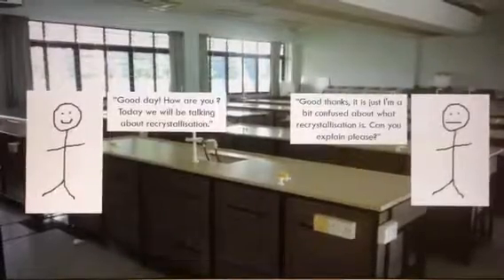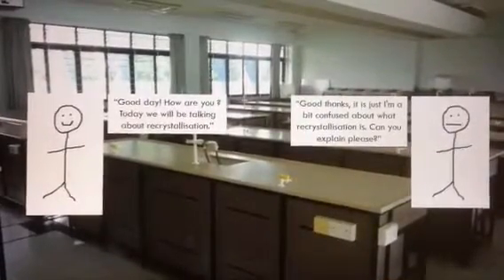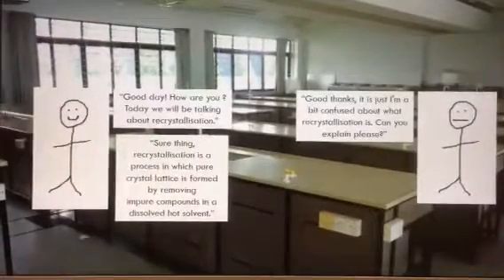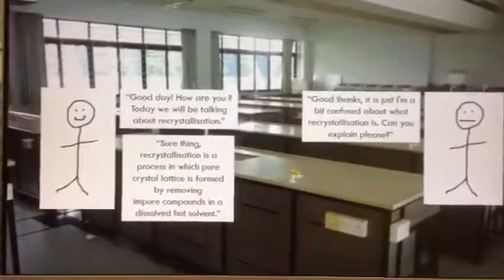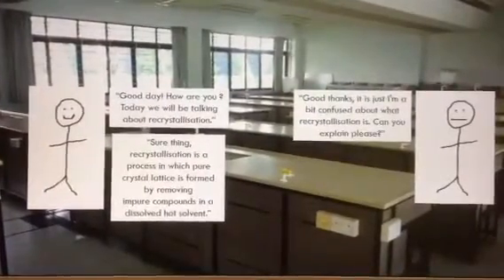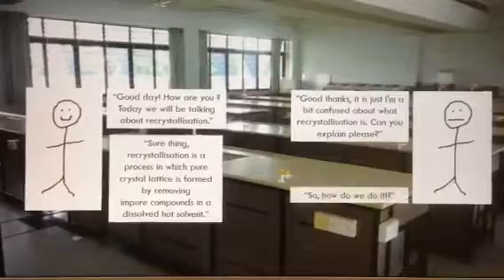Good, thanks. I'm a bit confused about what recrystallization is. Can you please explain? Sure thing. Recrystallization is a process in which a pure crystal lattice is formed by removing impure compounds in a dissolved hot solvent. So, how do we do it?